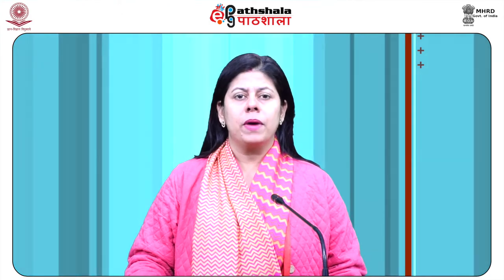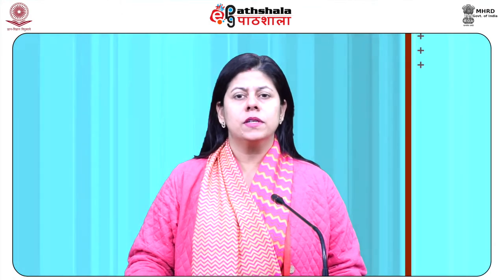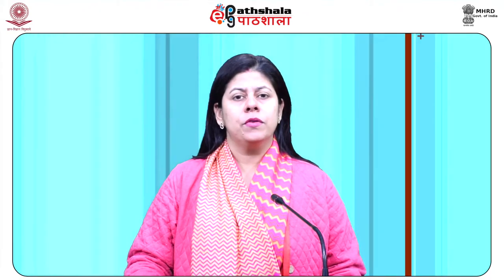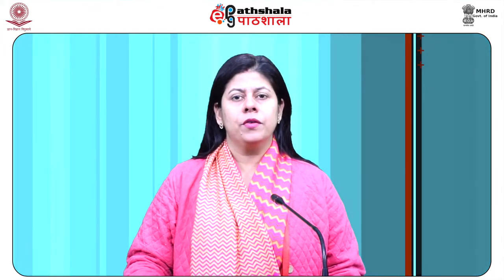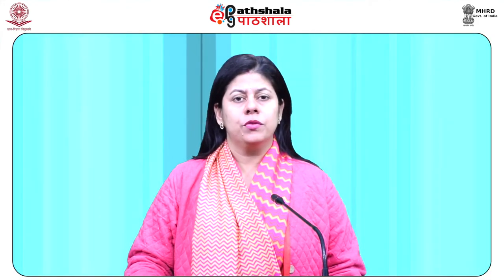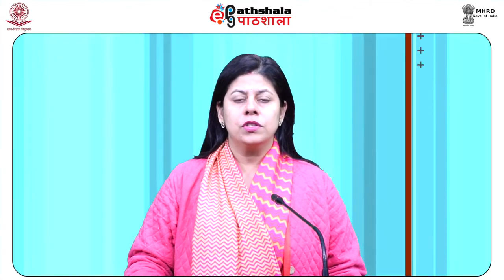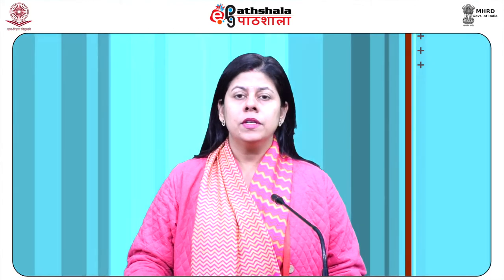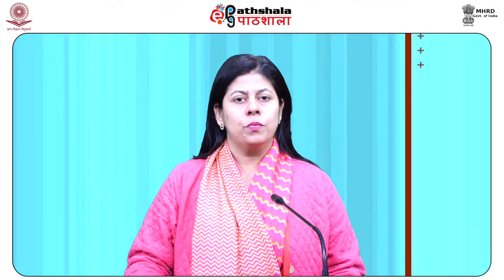Petrographic microscope. A petrographic microscope is a type of optical microscope used in petrology and optical mineralogy to identify rocks and minerals in thin sections. The microscope is used in optical mineralogy and petrography, a branch of petrology which focuses on detailed description of rocks. The method is called polarized light microscopy.